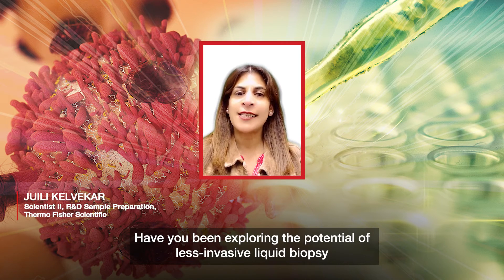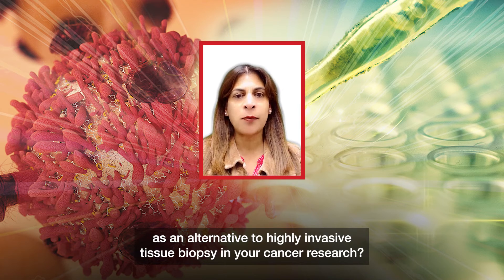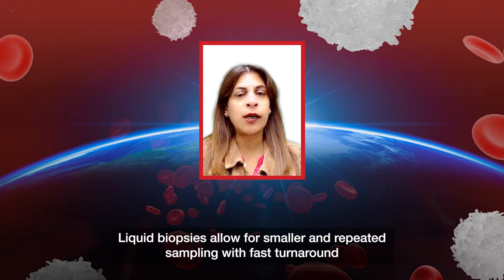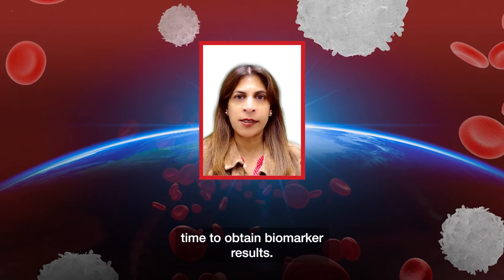Have you been exploring the potential of less invasive liquid biopsy as an alternative to highly invasive tissue biopsy in your cancer research? Liquid biopsies allow for smaller and repeated sampling with fast turnaround time to obtain biomarker results.